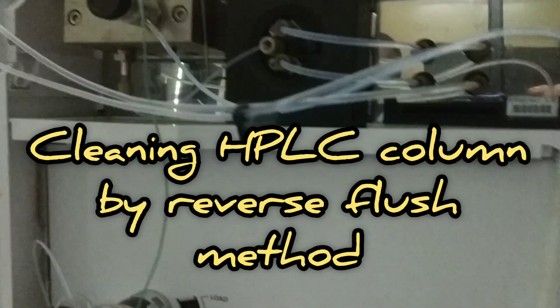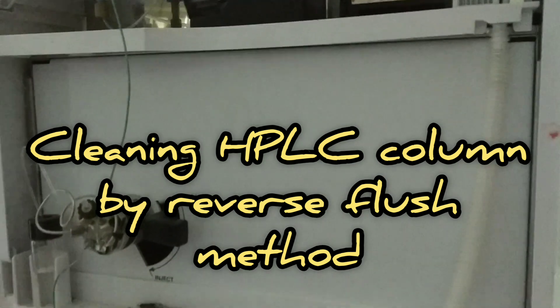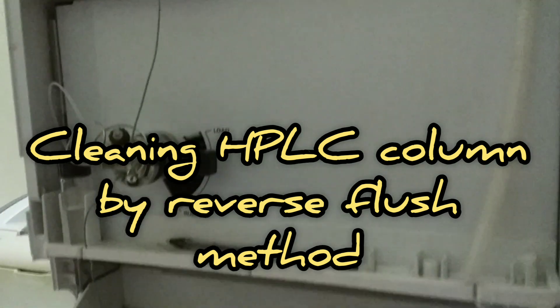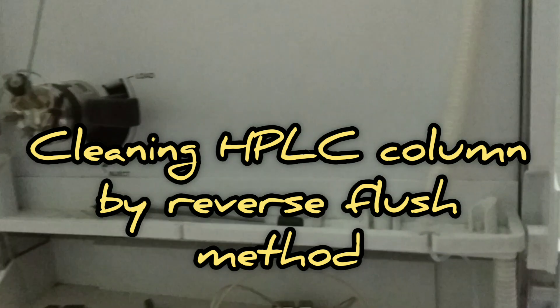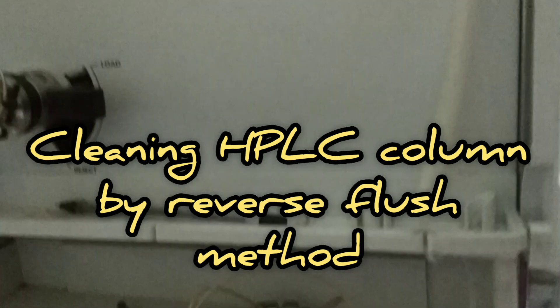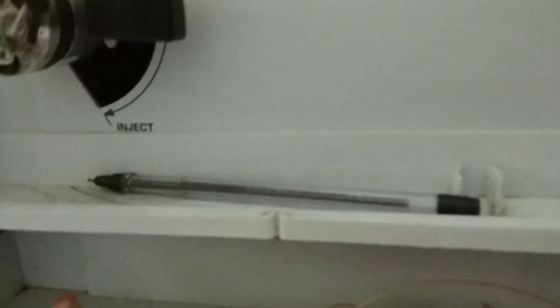I'm going to show you how to clean an HPLC column by the reverse flush method. Caring for the HPLC column might be simple, but it is exceptionally important to the health, lifetime, and productivity of our column. Column health can greatly affect the analysis as well. This video is mainly focusing on how to clean the HPLC column through reverse flushing.